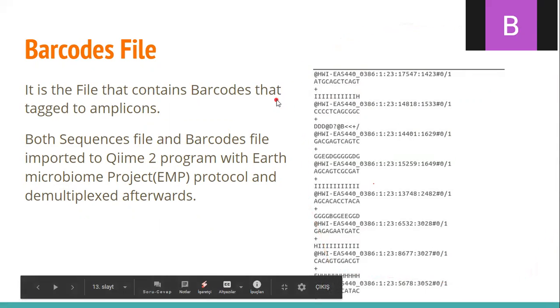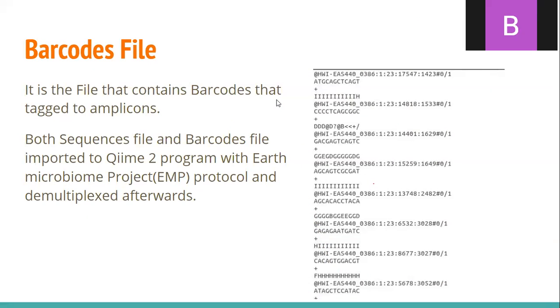We tagged our sequences, and the sequences file and barcodes file are imported together in QIIME 2 with the Earth Microbiome Project protocol. For our experiment, we have used the single-end Earth Microbiome Project importing protocol, which I will mention later.